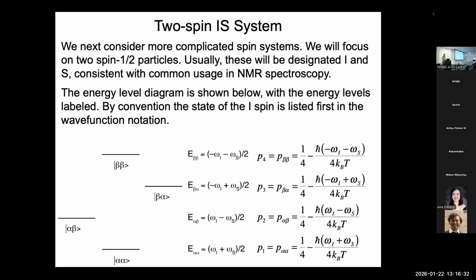The big exception will be when there are identical spins, like the hydrogens in a methyl group. And then one has to be more careful because the methyl hydrogens are magnetically equivalent to each other, and that means a little bit of group theory has to come to bear. But until we get there, understanding 2 spins is enough.